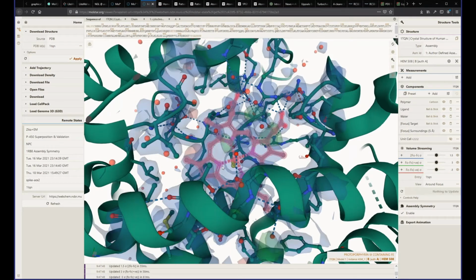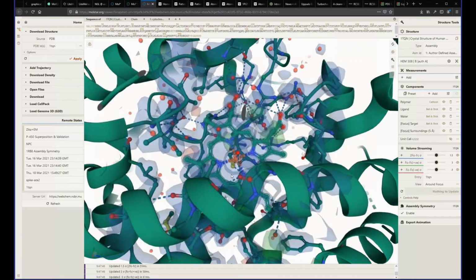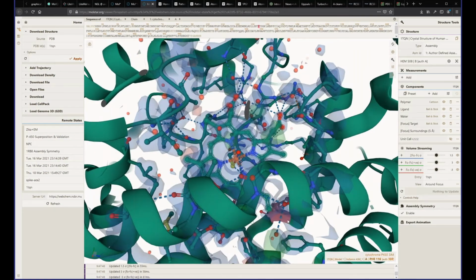Currently, this is a prototype implementation, because we do not have a stable server where we store all the data that users have saved. But over time, we plan to make this into a stable service for users to share their results.